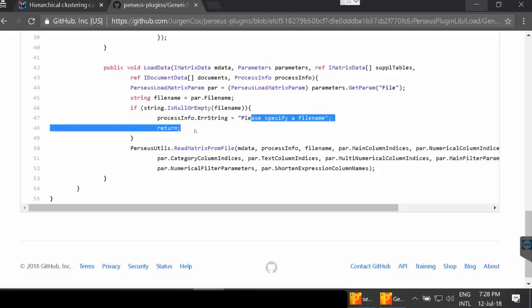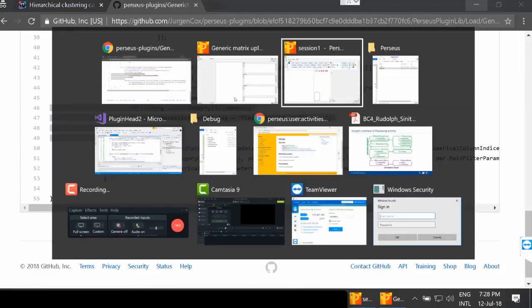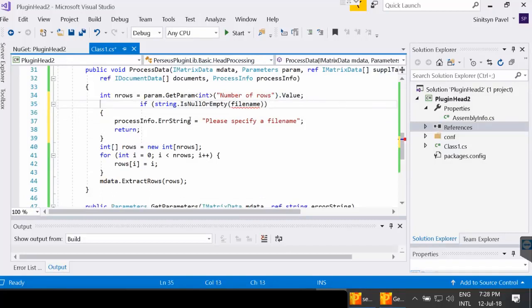What we should do is copy. As usual, we can name it stealing, we can name it learning. So where should we do this? We got the number of rows. Probably we should check if the number of rows that was specified is really that many rows already in the matrix. So basically, what should we do? If the number of rows is larger, more than what? Probably the rows of the matrix. Then it is an error.